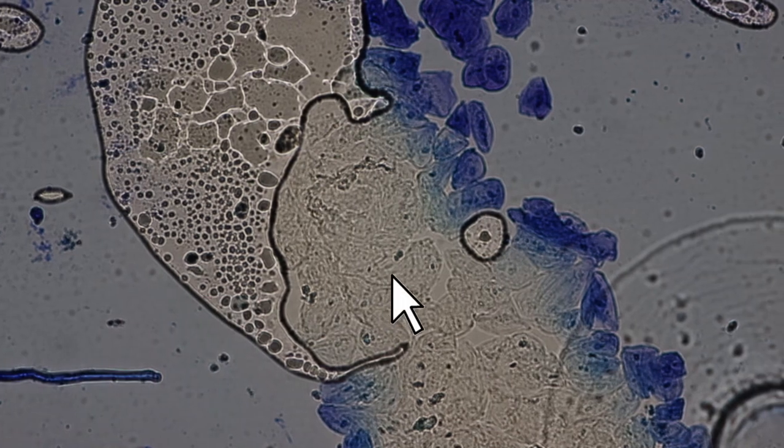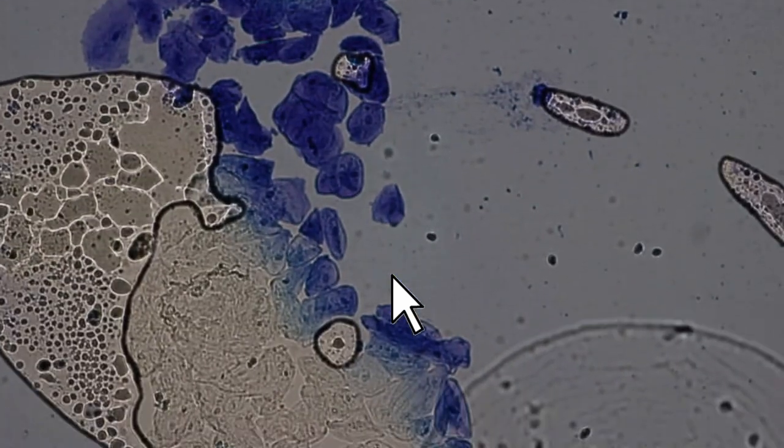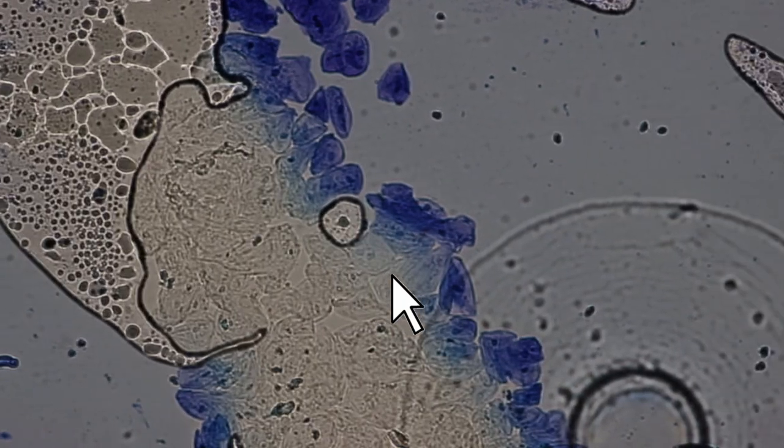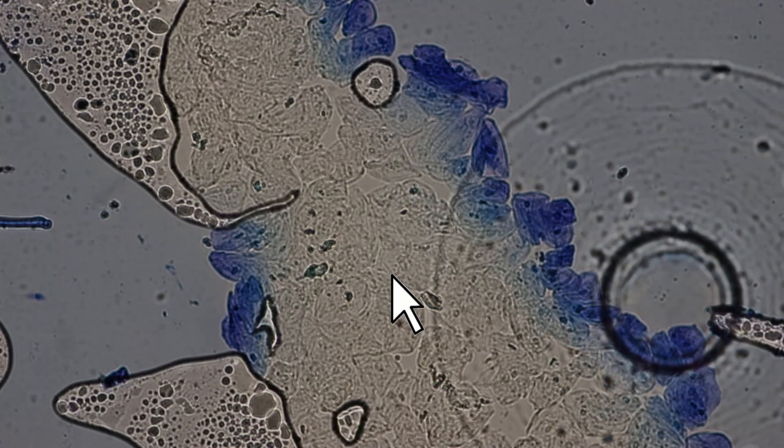No, let's go back here again, okay. These cells here obviously are stained, and you can see as the methylene blue diffuses inwards, more of the cells, also in the center, become more and more stained.